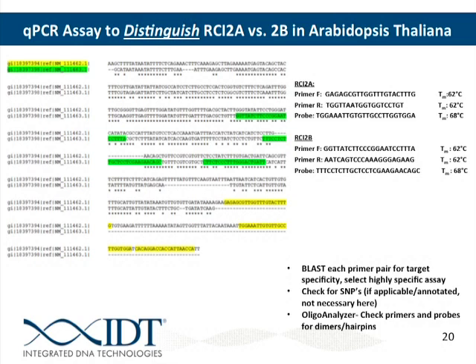Quick question, so the dNTP concentration would come off the label from our DNA polymerase master mix that we buy? Is that part of the master mix? It's not always available, but we usually, as a default, set to 3 and 0.8 as a good starting point. If you know for a fact that your master mix deviates from that, you can set it accordingly. It's a good middle ground to use the default rather than nothing. But of course, if you know the more appropriate concentration, then that's what you should use.